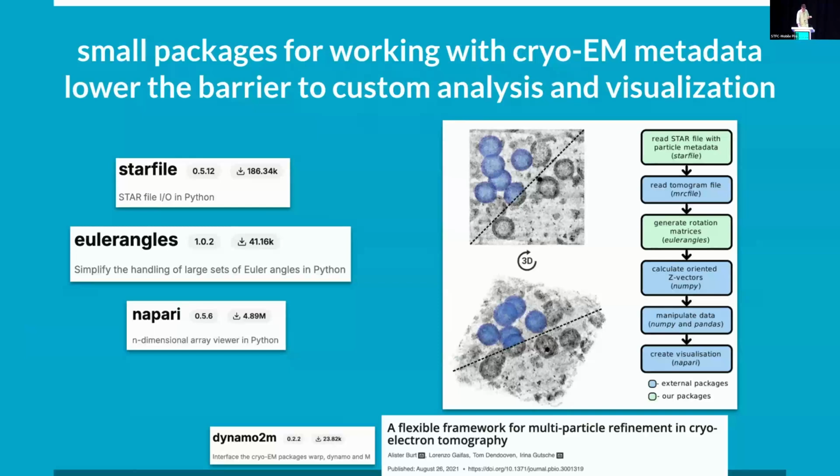This lets you do cool stuff like custom visualization, or maybe you've got some little analysis that you need to do where you exclude particles based on distances to something. We can't write command line tools for all of these little workflows. It's complex biology. Your problem's probably a bit specific and I probably haven't seen it before. But enabling people to solve their problems is, I think, very important.